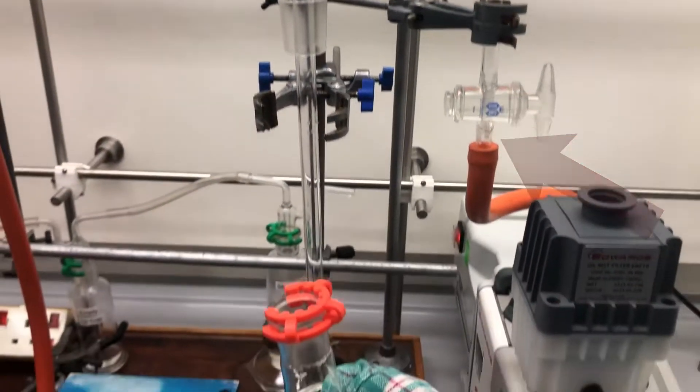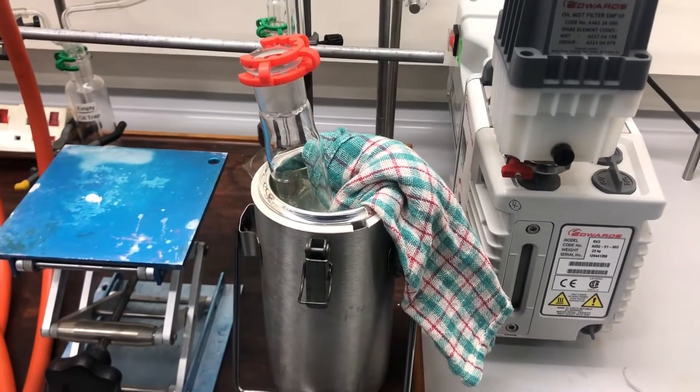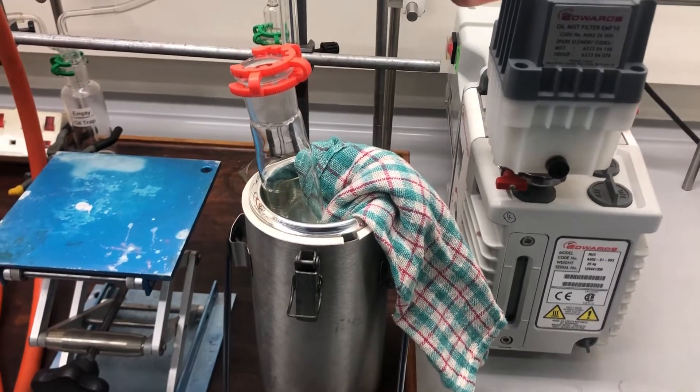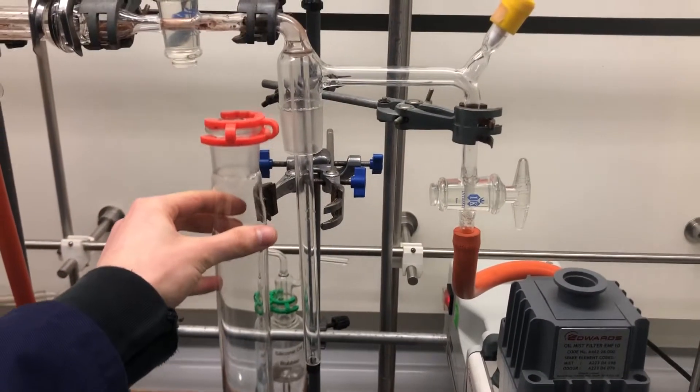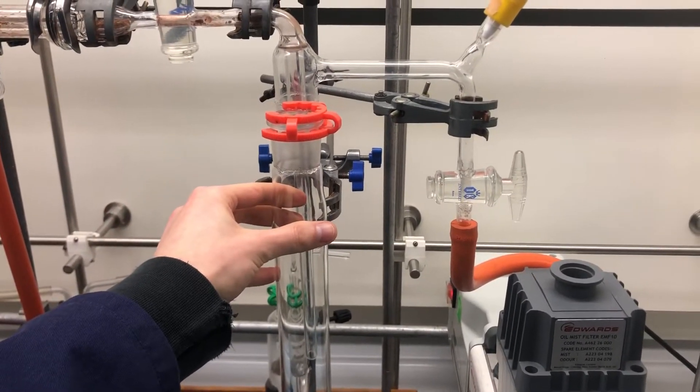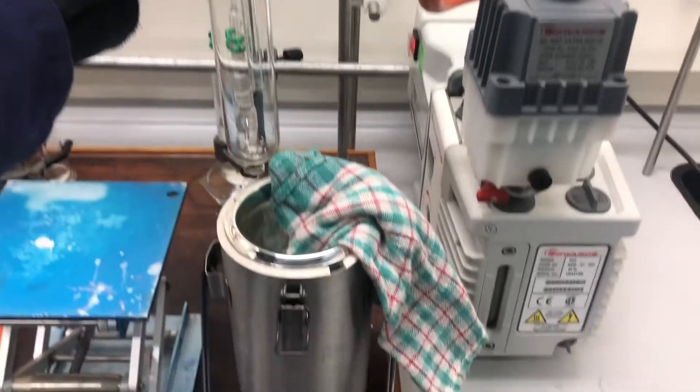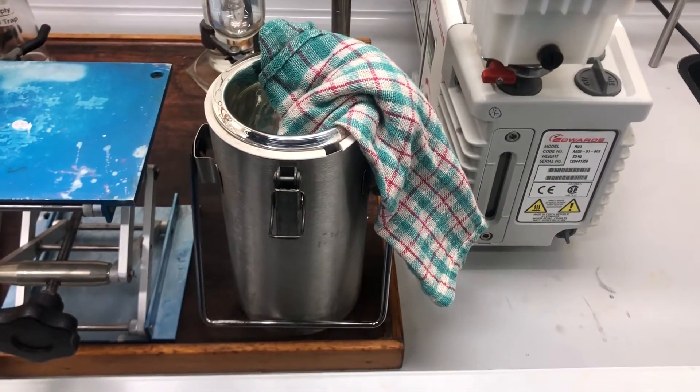We have a solvent trap with a liquid nitrogen dewar that is placed around it. That cools all the gases that come off of our system, pulled off by the pump, and it condenses into that solvent trap there, preventing any gases going into the pump and condensing in there, which can damage it.